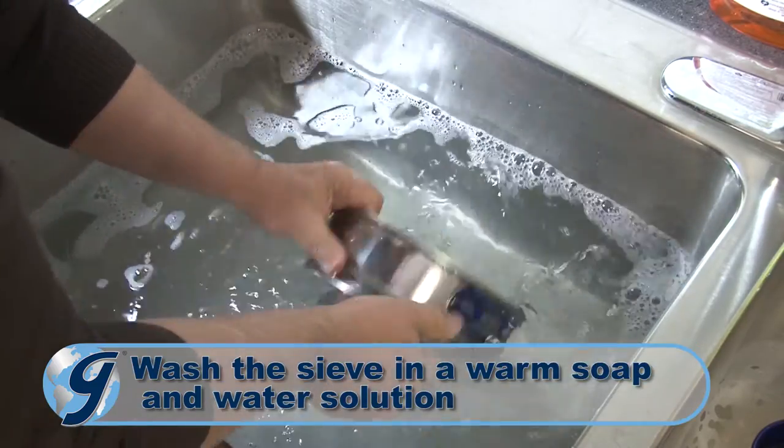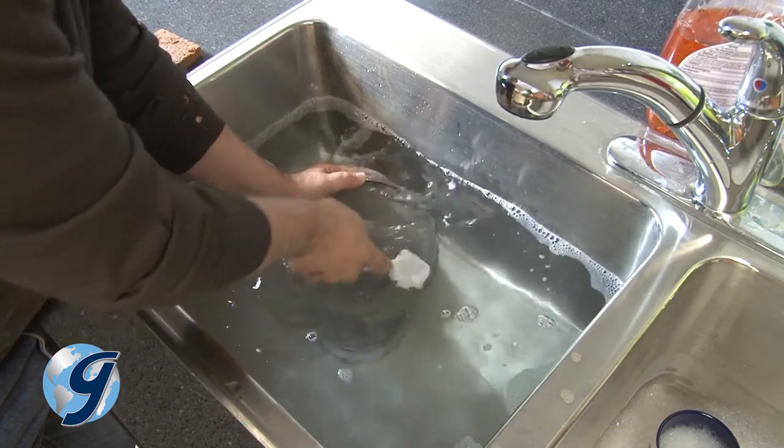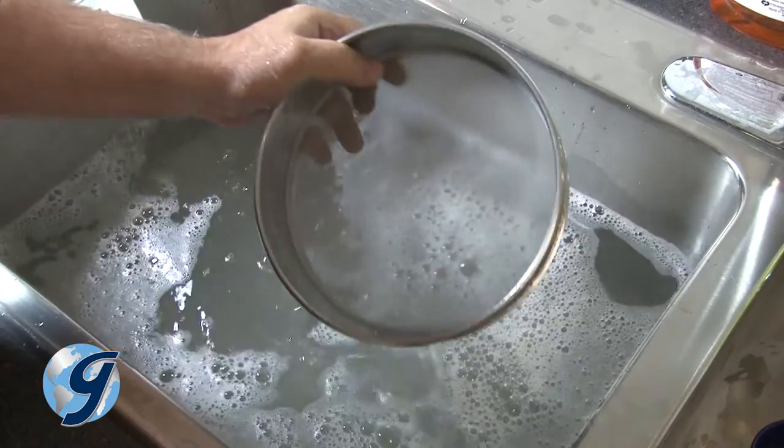Wash the sieve in a warm soap and water solution. Brush the underside of the sieve carefully in the water.